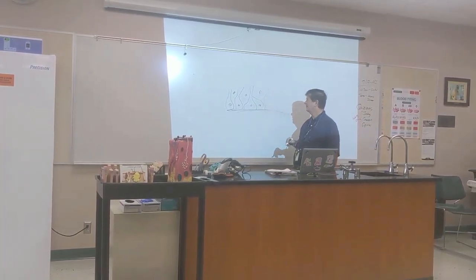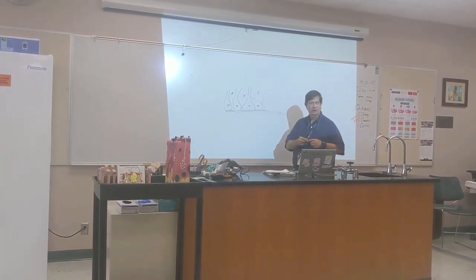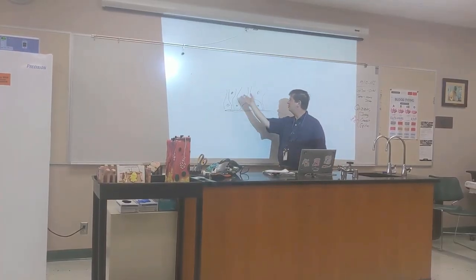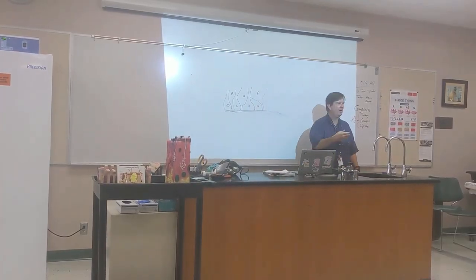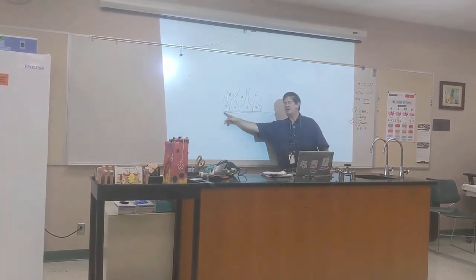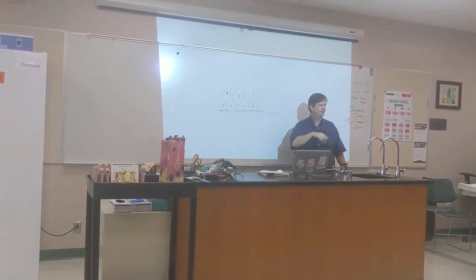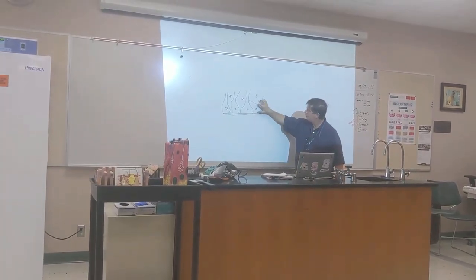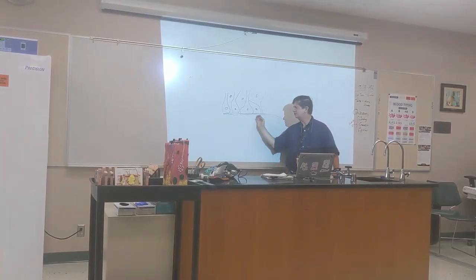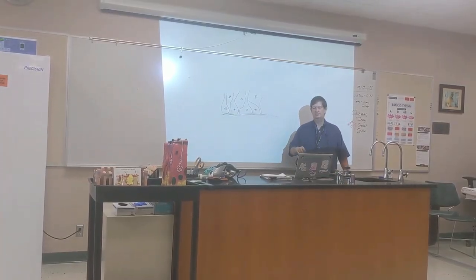Now, you look at this. Suppose you were lousy with a microscope and you didn't know how to focus. You couldn't get the membranes visible very well. You'd see a row of nuclei. You said, that's stratified. It's not. How do you know it's not? They're all attached to the same basement membrane, all attached to that same collagen fiber at the bottom of the tissue, yes? Even ones that don't go all the way up to the apex. These are all one tissue because they're all attached to 1 layer at the bottom. Good? So you know it's simple.